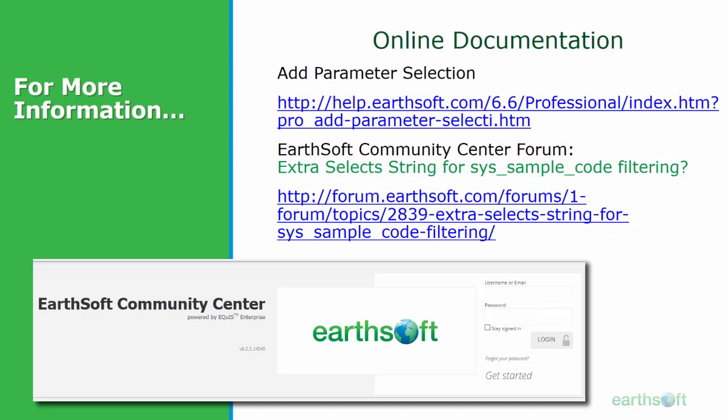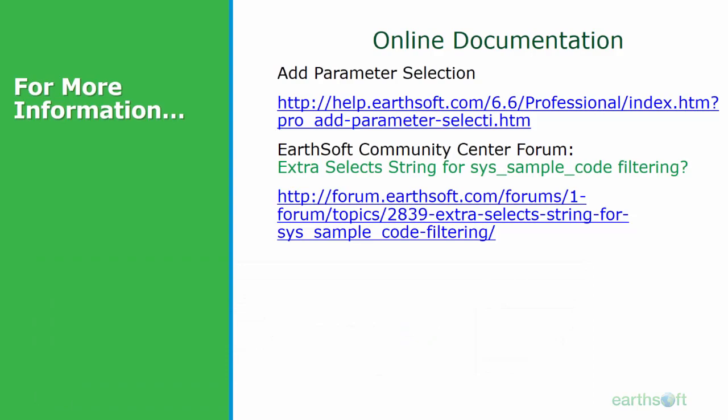Additionally, there have been a couple of really good conversations on the community forum about using and applying extra selects. If all of you are interested, we can certainly use the office hour post on the community center to share all of our favorites. I can maybe add the items that I've talked about today as well, so that we'll have those available there. But I'm sure that there are tons more ways that you can apply this that I haven't talked about, just because it's a really handy tool, and I probably don't have as much imagination in the application as all of you who work with this data on a regular basis.